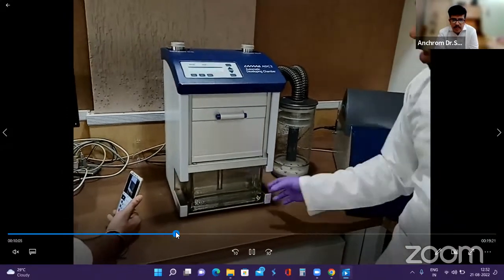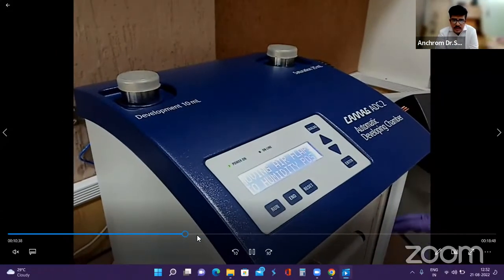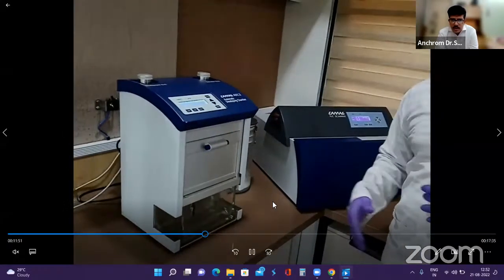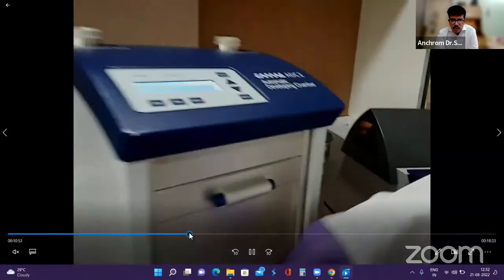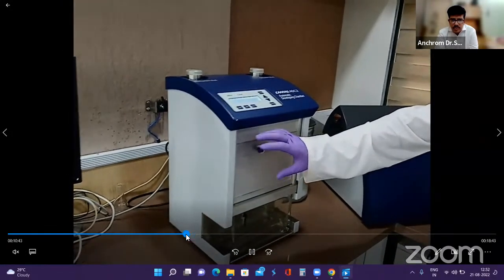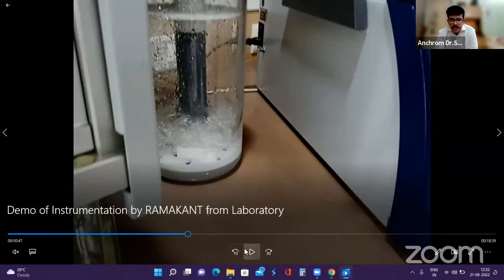The plate comes in and goes inside this chamber for the development, and we already have seen in ADC2 how it works. So humidity happens through this humidity control. You can see on the right hand side, there is a humidity chamber. I'll just go a few seconds back and show you how the humidity control happens. So here it goes. You see, this is the chamber, and the air is being bubbled throughout to condition the surface of the plate.